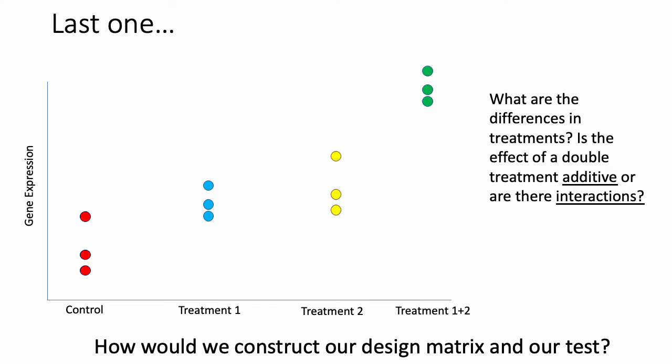Here's one more very common experimental setup. If you're feeling confident, pause the video and try to figure out how you would construct the design matrix to test the interaction effect of the two treatments.